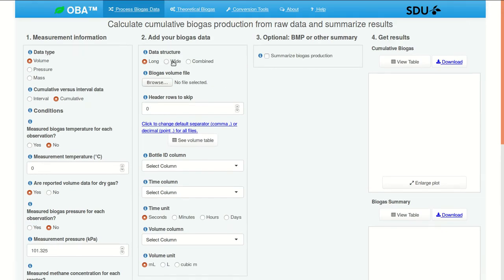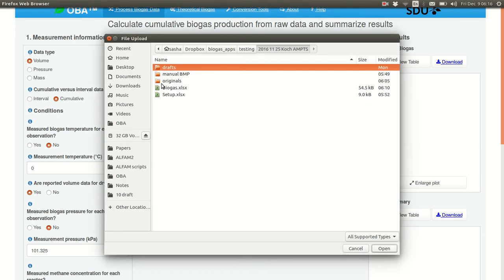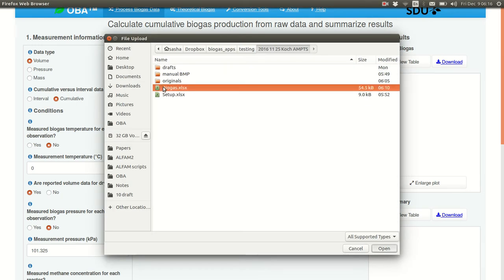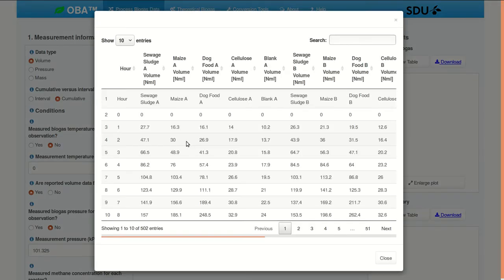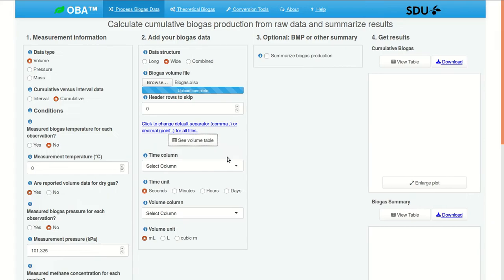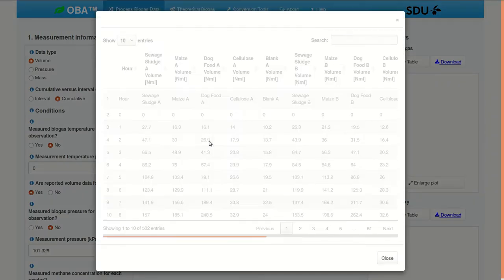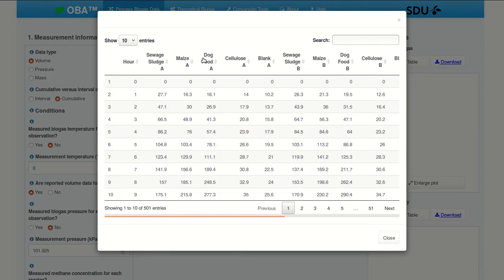Data structure. It's wide. Let's take a look at these data. This is the biogas file. You can see the two header rows. We need to skip the first one. So we need to change this to one. Let's take another look. That looks correct.